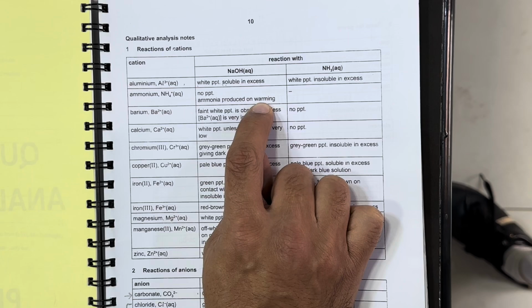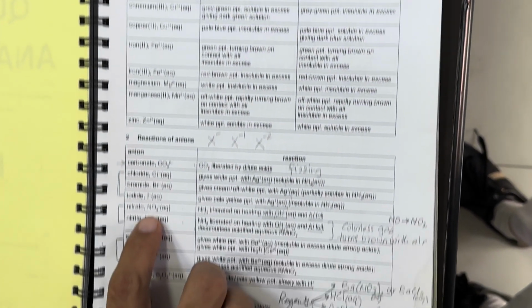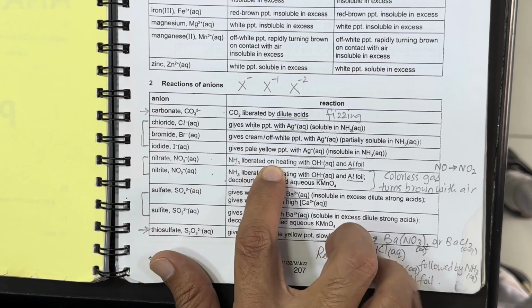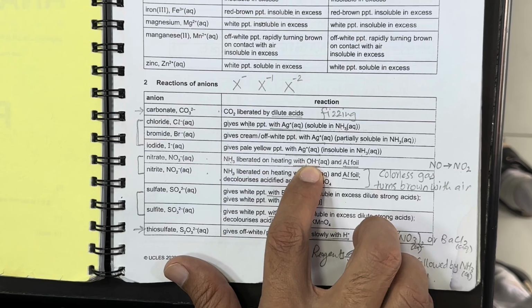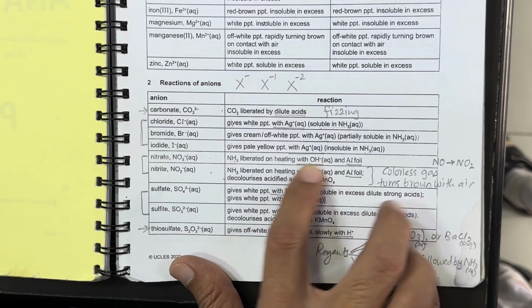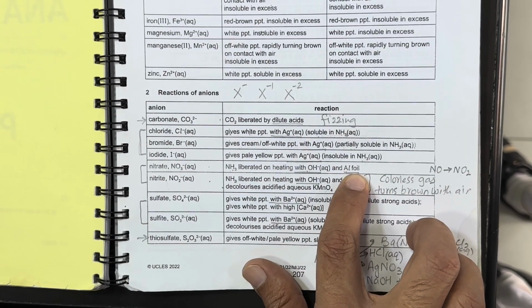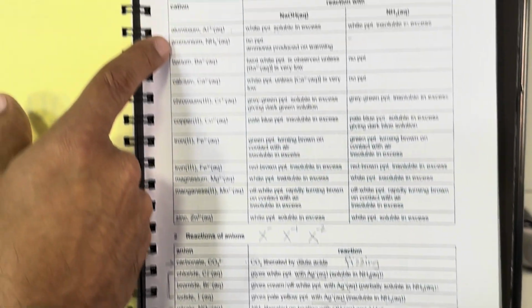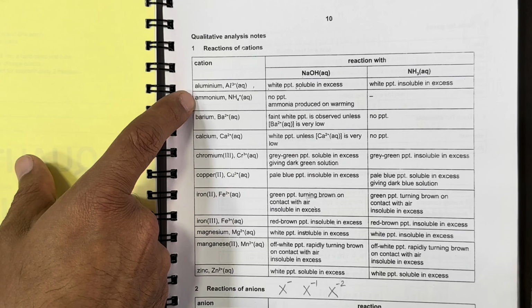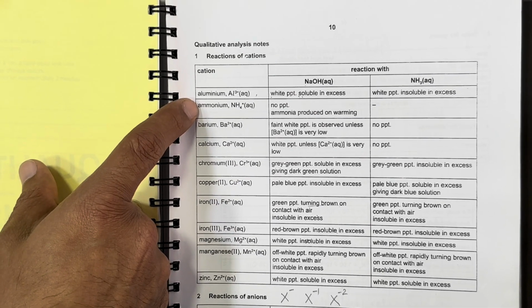So the gas which has liberated turned the damp litmus paper. And if we look at the nitrate ion test, it says the same. The ammonia will be liberated with hydroxide, meaning sodium hydroxide. The only difference in these two tests is that in nitrate we add aluminum foil also, but in sodium hydroxide to detect ammonium, we do not add aluminum foil.